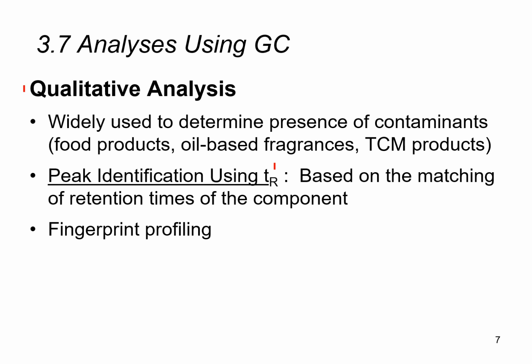So therefore, using this concept of retention time, or by matching the retention times of particular chemical components, I can actually identify whether certain chemicals are present in certain samples. So this technique is actually used in a wide variety of applications. So you can see that in food, in fragrances, and also in various medicinal products.